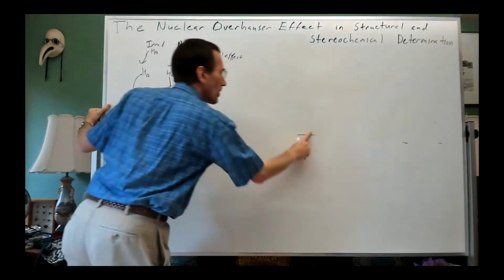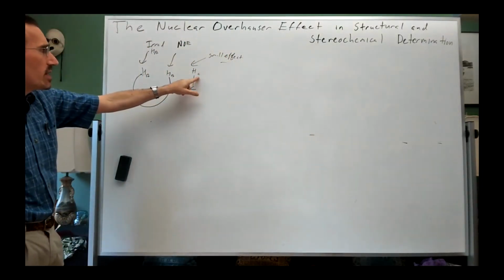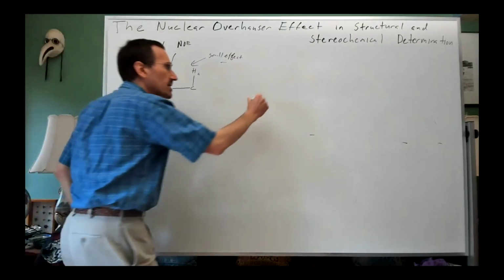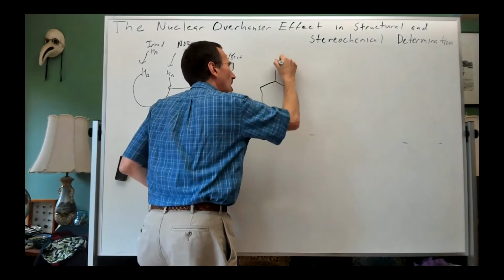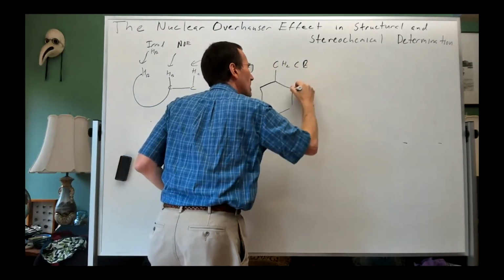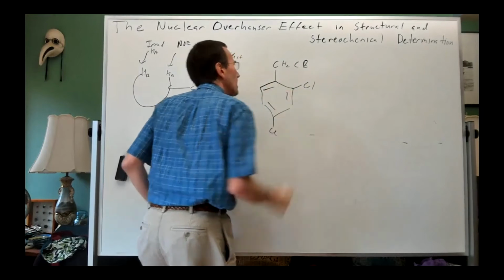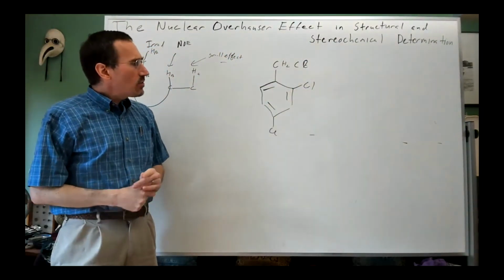So again, sort of not a litmus test. If you just saw a change in HC, you might say, oh, HC must be close to HB. And yet it's not that simple. And I'll give you a quantitative example. I believe this was from a book from Jeremy Sanders, although I'm not sure right now. I didn't make a handout on it, but he's looking at this molecule here.